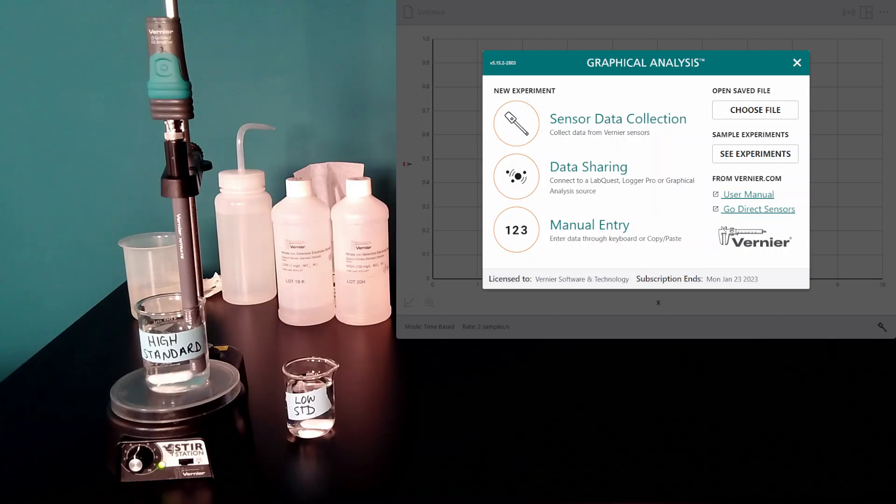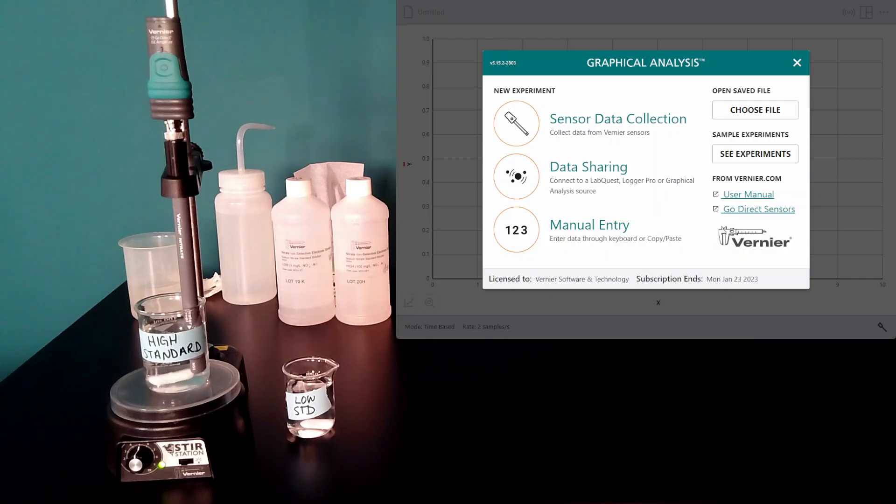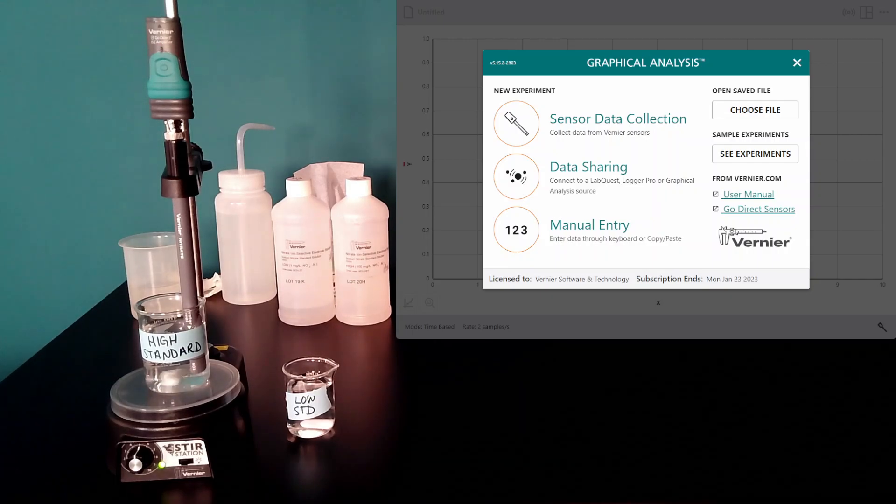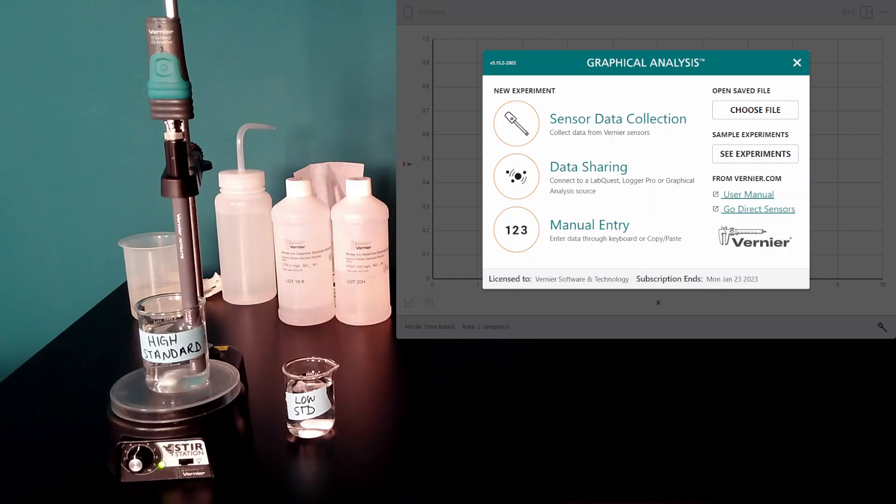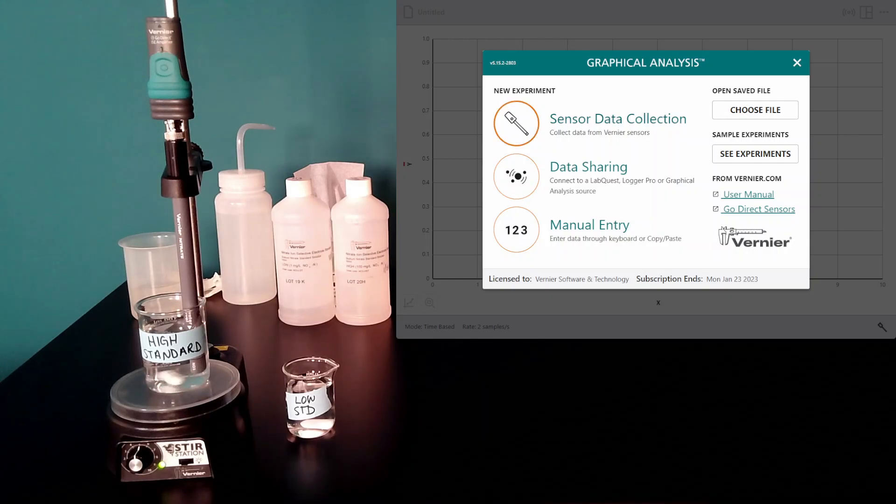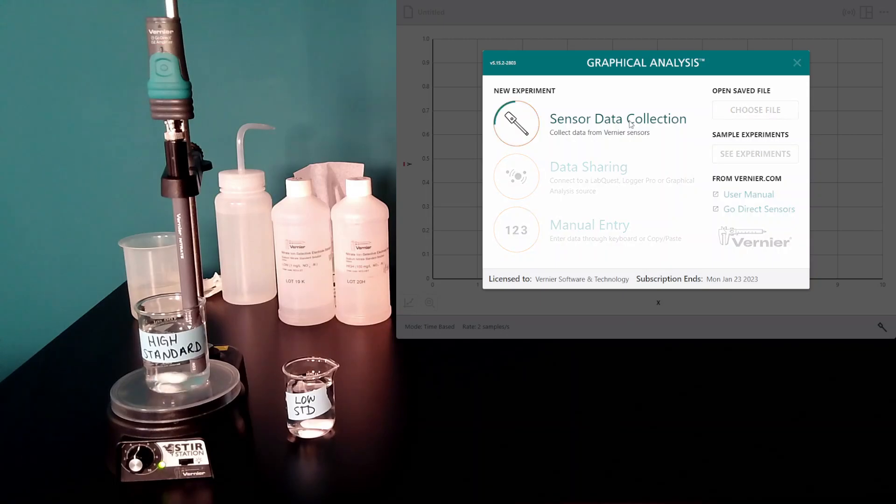This video is to help troubleshoot and calibrate a GoDirect ion-selective electrode. I have a nitrate electrode attached to my amplifier, and I'm going to connect it in graphical analysis software.